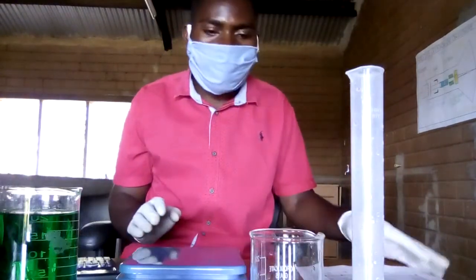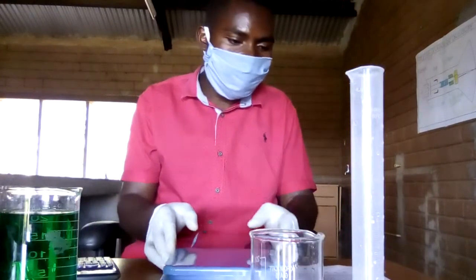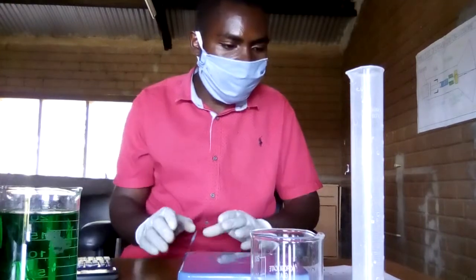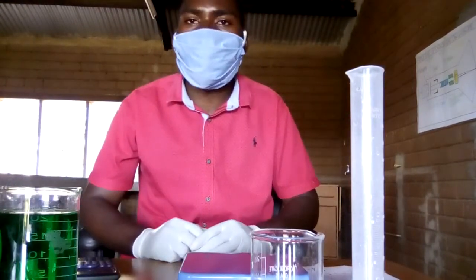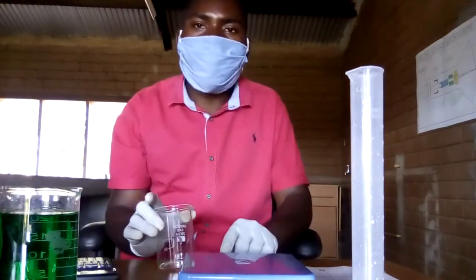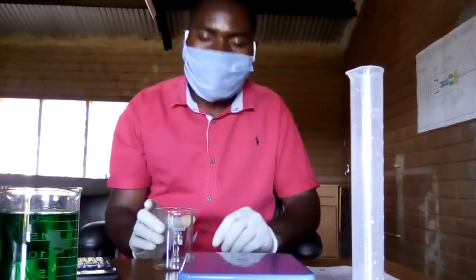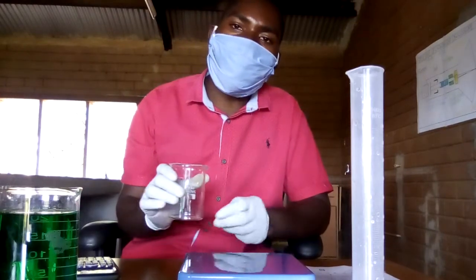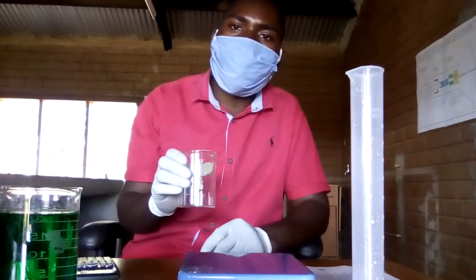So to begin with, in this experiment, I am going to start by measuring the mass of the empty beaker. If you have got the beam balance with you, make sure that you follow the following steps.